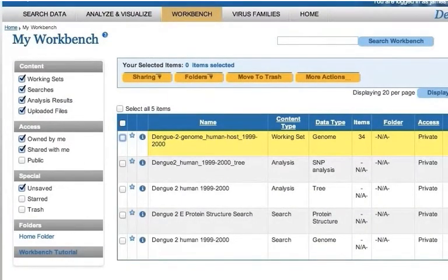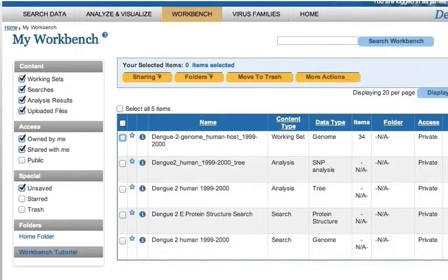Now the sequences are saved to your workbench. You can run various analyses such as multiple sequence alignments, phylogenetic tree generation, sequence variation analysis, BLAST, etc., on the working set at any time.